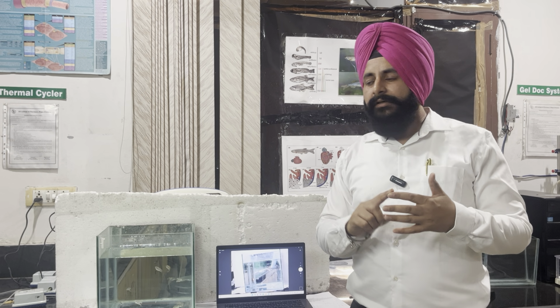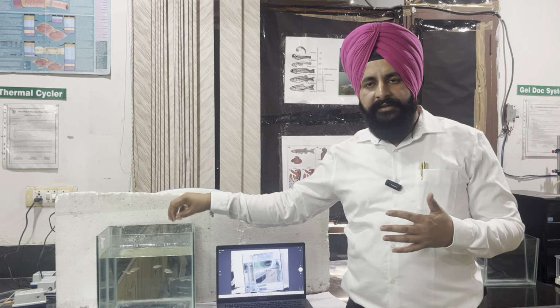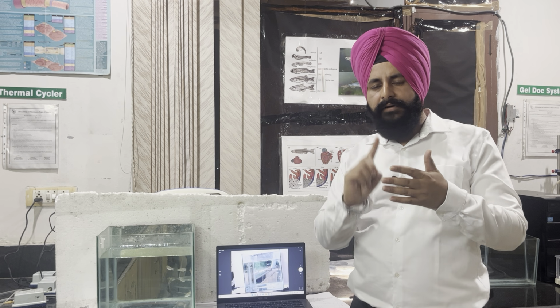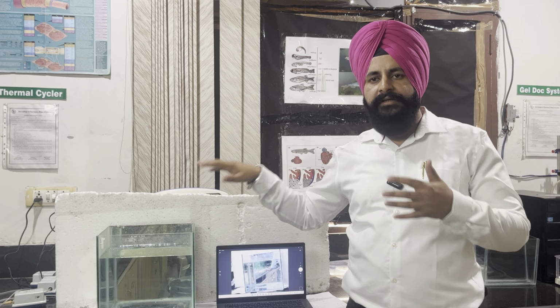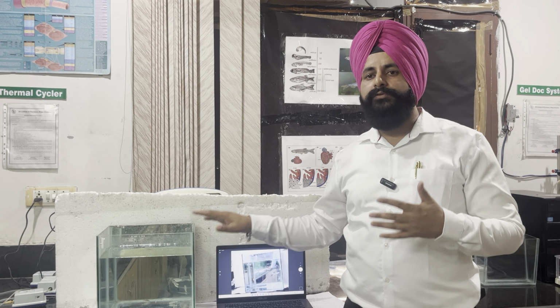For acute, you will do a 5-minute daily trial. You will place a zebrafish in the water that has the mirror chamber apparatus, and for 5 minutes daily you will place the zebrafish and keep it under surveillance using your webcam. This protocol would run for 4 to 7 days.